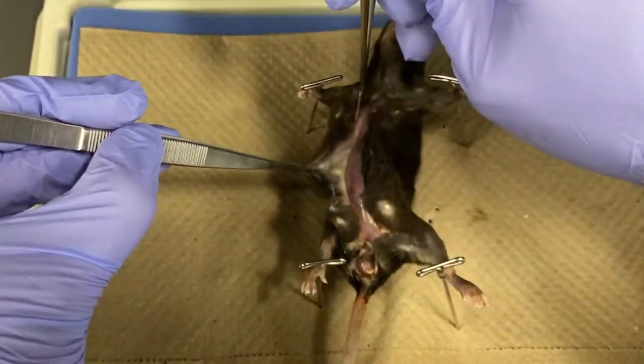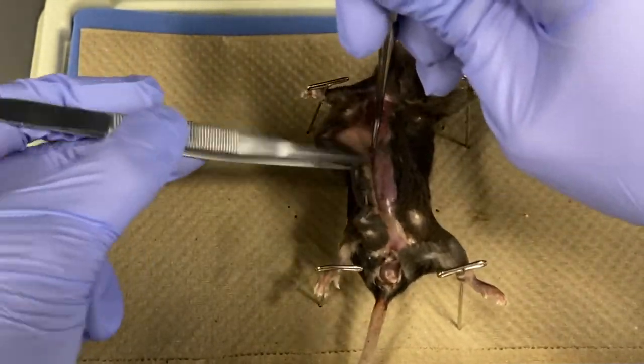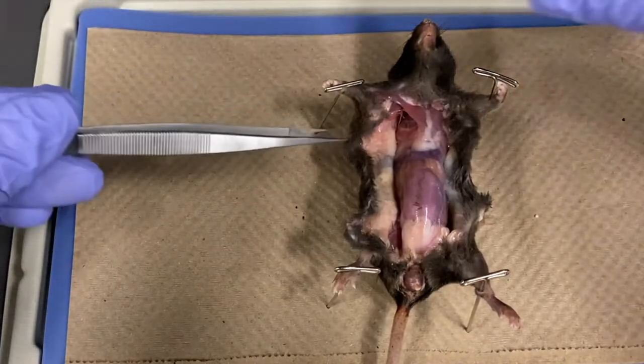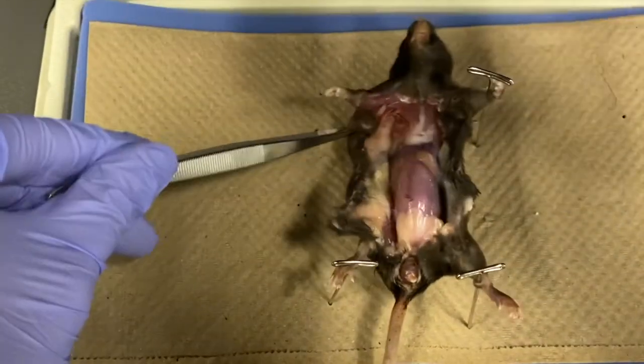Separate the skin from the muscles using a blunt probe. Then pin back the skin to expose the body wall.